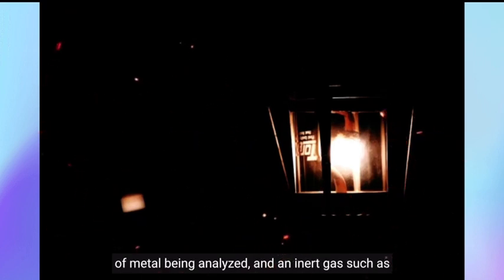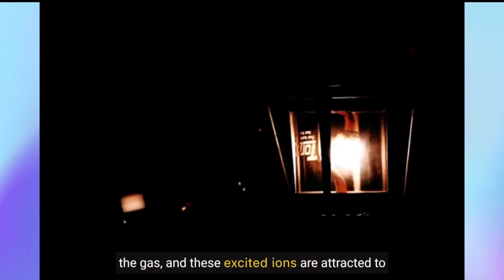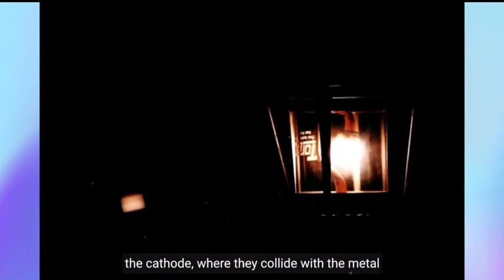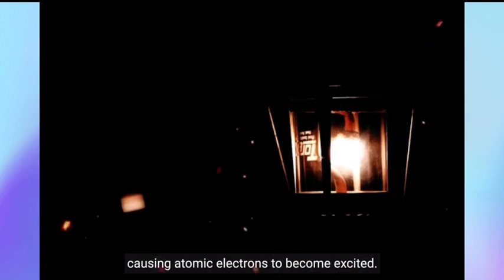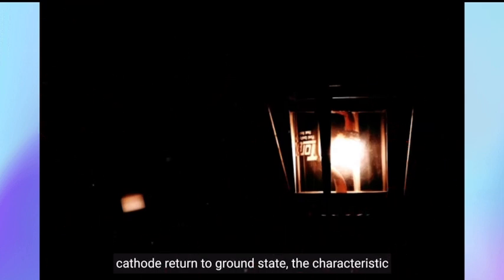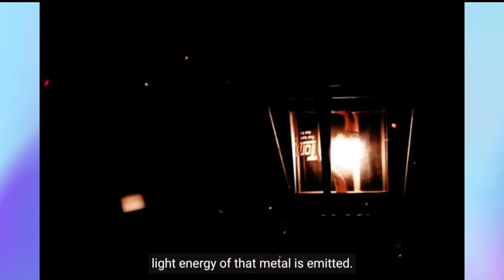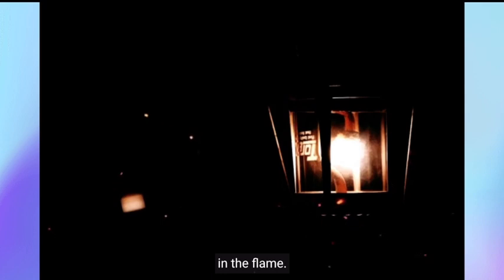Hollow-cathode lamp. HCL contains an anode, a cylindrical cathode made of the metal being analyzed, and an inert gas such as helium or argon. Principle: applied voltage causes ionization of the gas, and these excited ions are attracted to the cathode, where they collide with the metal coating on the cathode, knocking off atoms and causing atomic electrons to become excited. When the electrons of the metal atoms from the cathode return to ground state, the characteristic light energy of that metal is emitted. Vaporized metal atoms from the sample can be found in the flame.